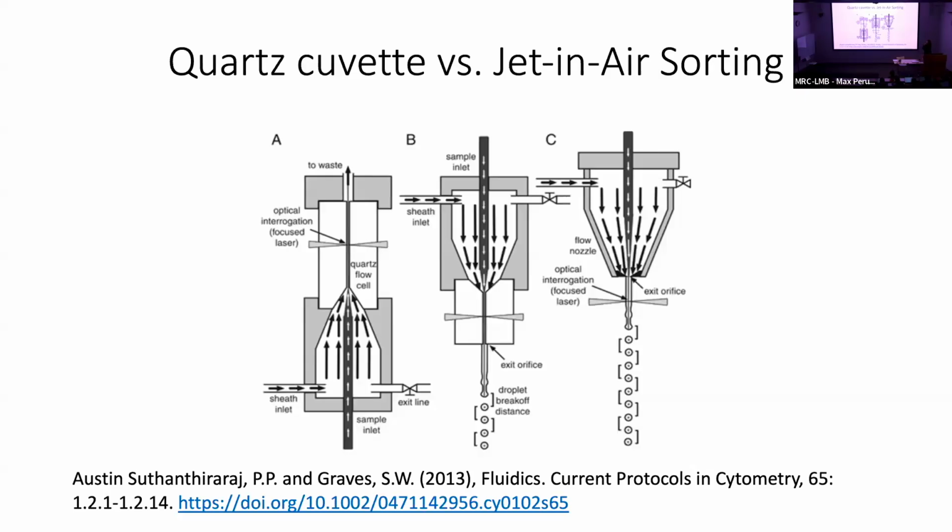When we talk about cell sorting, that's a different story, because what we're doing is we're still flowing cells and hydrodynamically focusing them, and we're still pulsing them with lasers. But what we're doing is we're then actually purifying out those cells by placing them in droplets, for any kind of downstream analysis.